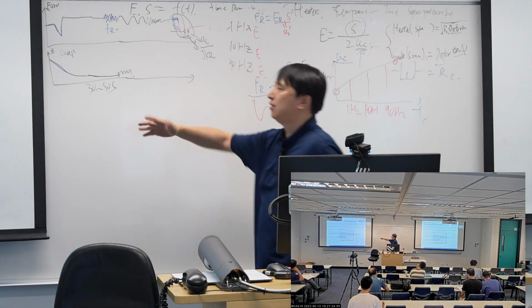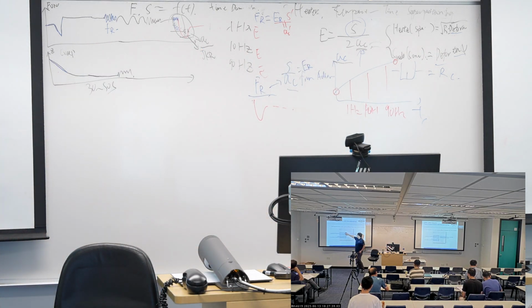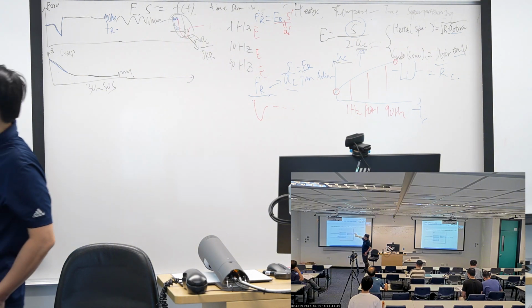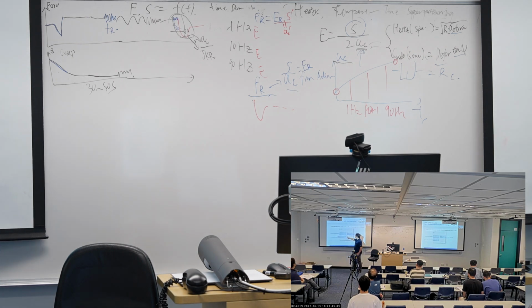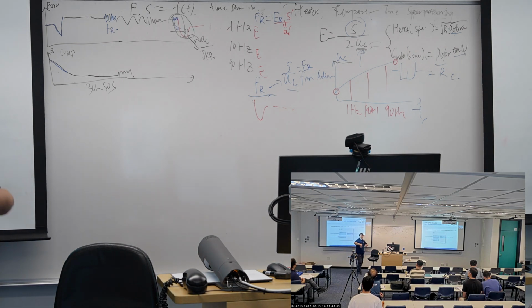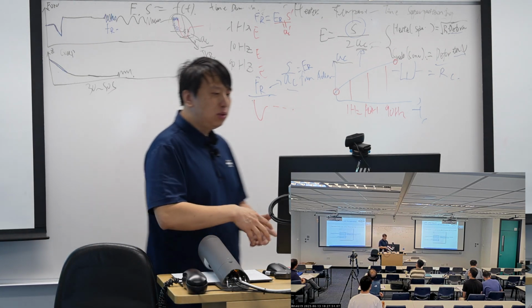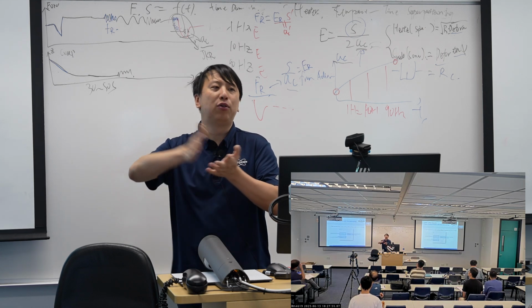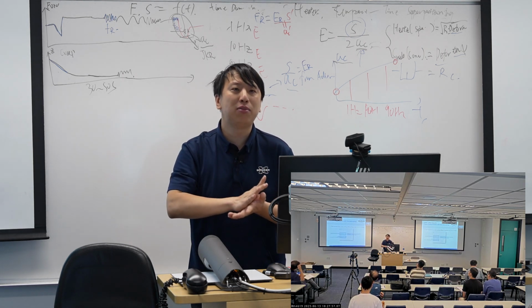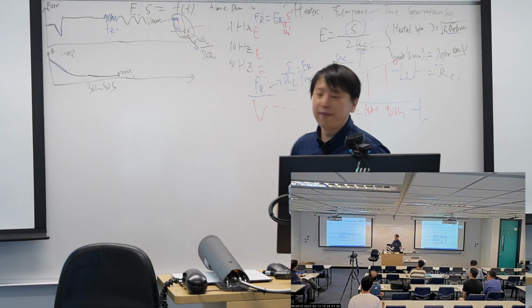And then the other stuff is relatively easy. We need to set up the frequency range, set up the reference frequency, and here we need to set up how we want to modulate our samples. We need to apply a force first, and then the force will cause a deformation of the sample, and then we need to modulate our materials.